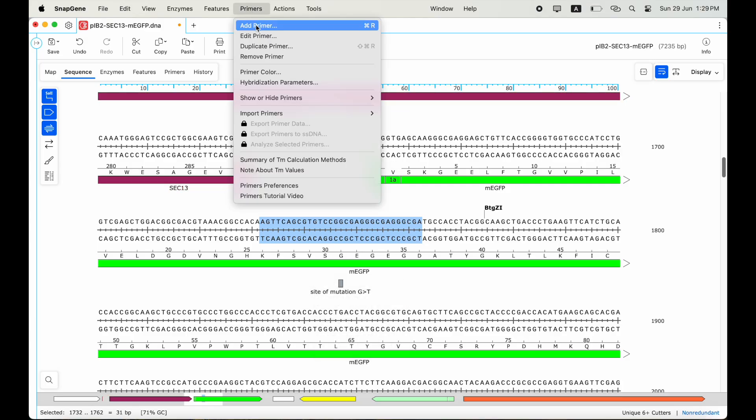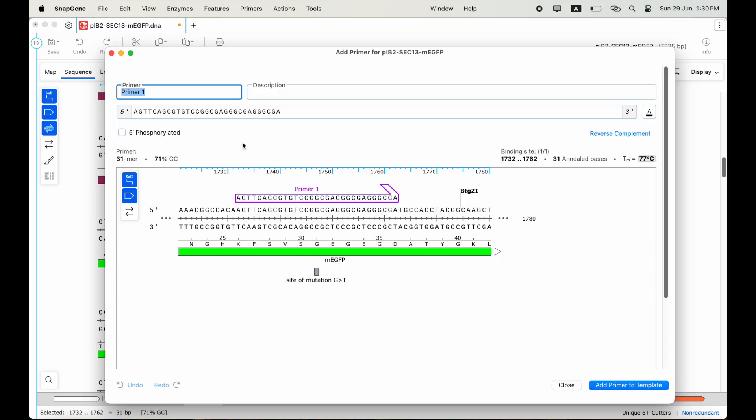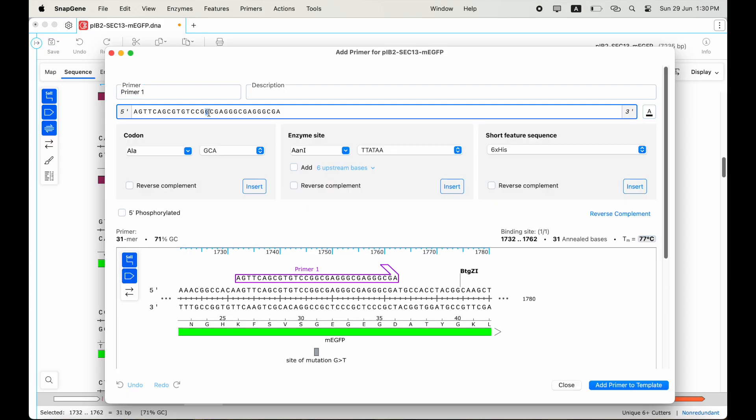Next, I will create new primer by going to primers, add primer, and I will start by creating a primer using the top strand first. I now need to change the G allele to a T allele, my intended mutation. Notice how the new base is mismatched.